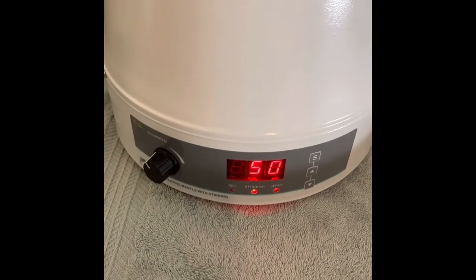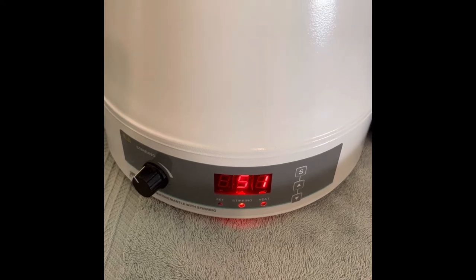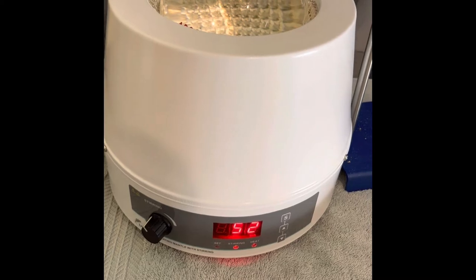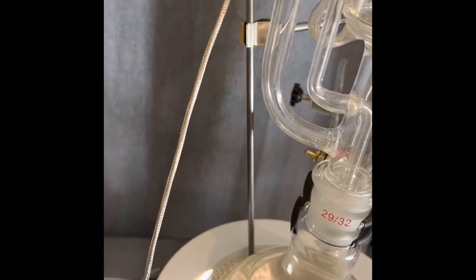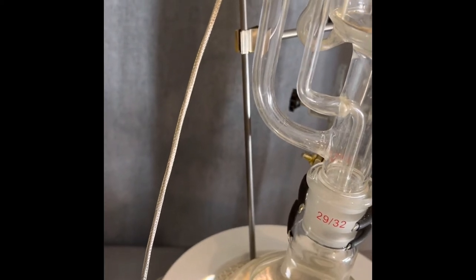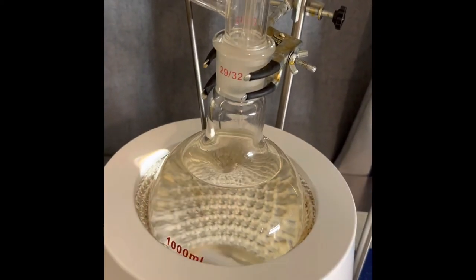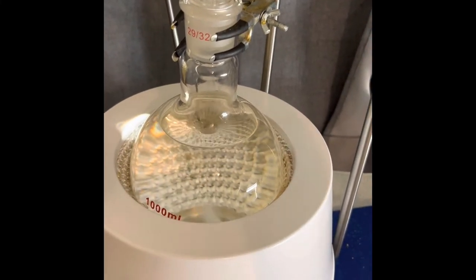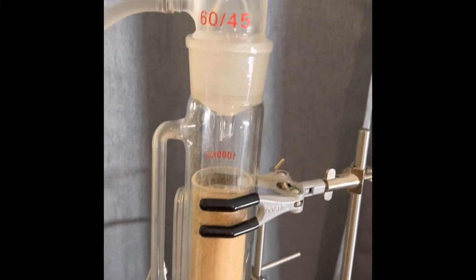All right, so we have our heating mantle turned on. The temperature you're gonna set it to is going to be different than I run it. I run each one at different temperatures, different times, and it's all based on my jerry-rigged thermometer. I have to adjust for the temperature outside of the glass instead of inside, because for this setup, I do not have a thermometer port insert thing. Terrible explanation. But we've got this set up.